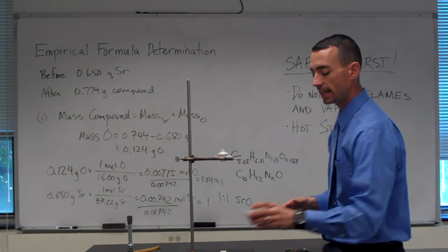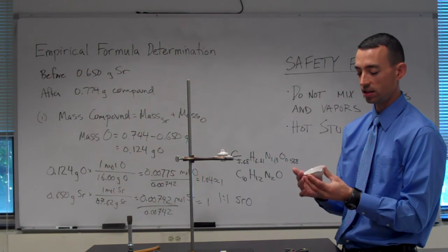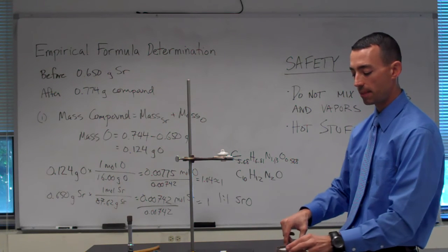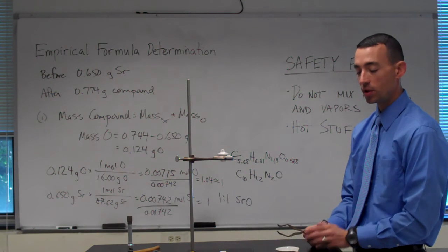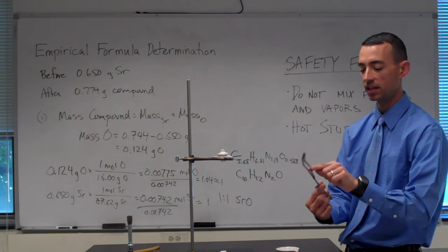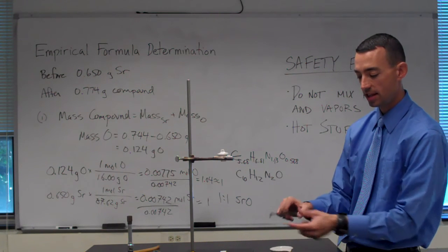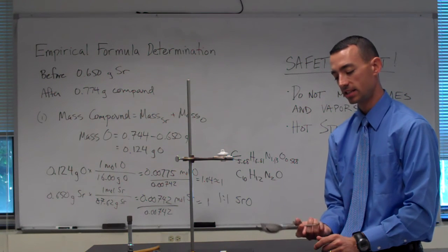Now, the zinc portion of the reaction will take place in an evaporating dish. Just a little porcelain dish that you can put the zinc and hydrochloric acid into directly, and then you can gently heat this over top of a steam bath, I believe, to evaporate off the liquid. When you're handling this when it's hot, you're going to want to use a pair of crucible tongs. Okay? They have a funny little shape in the stems of the tongs. You can just grab this pretty safely and securely with the tips of the tongs. Okay? And this is not designed to sit like this. It's a little less stable.